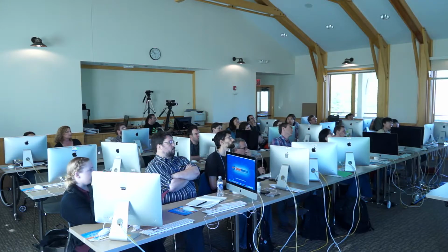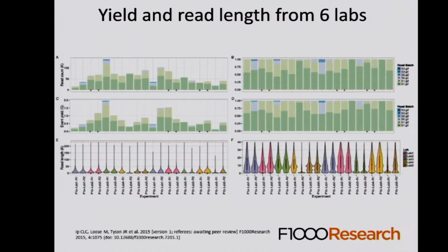Reads. All right. Up, down, up, down. The consistency of the flow cells is okay. It's got a lot better than it used to be. Some flow cells generate a lot. This one here and this one here generated 1.5 and 2 gigabases of data respectively. And then we have this one here, which generated a few hundred megabases of data. So you have to be a little bit wary in terms of yield.